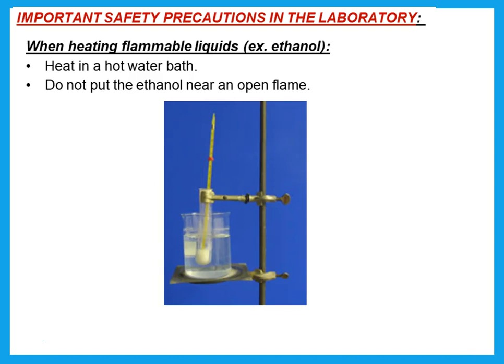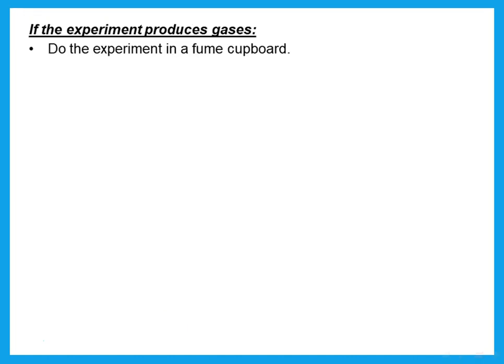I put it in the test tube and the test tube inside a beaker with water. This is called a hot water bath. So my precaution is heat in a hot water bath. Now, if it's not using ethanol, I take a look again.